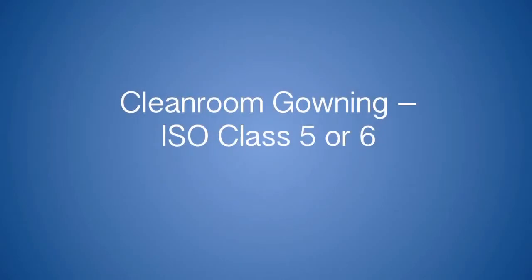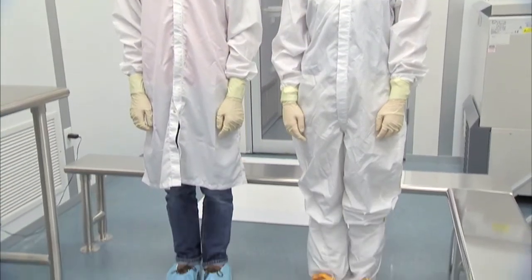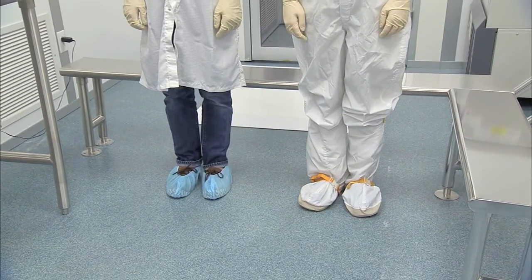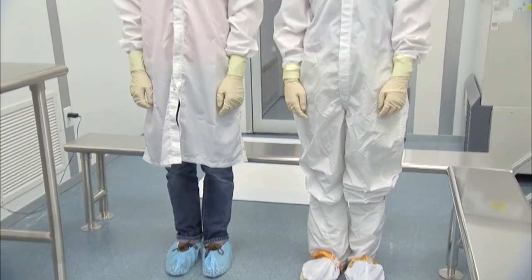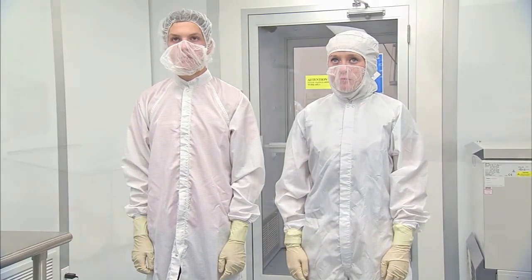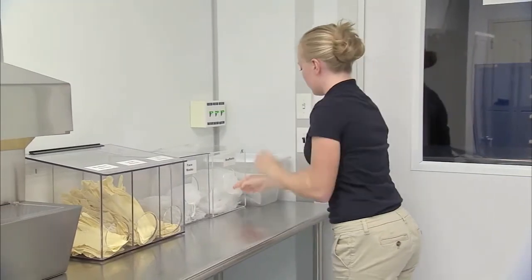Cleanroom gowning, ISO Class 5 or 6. Gowning for an ISO Class 5 or 6 cleanroom is slightly different than gowning up for an ISO Class 7 or 8 cleanroom. Instead of a smock, a full set of coveralls, or bunny suit, must be worn. However, the same principle as before follows, and the gowning process should go from the top down, starting at the head. First, place the bouffant cap over your hair and ears.